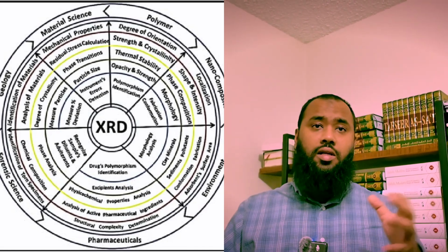So it has a far-reaching impact beyond what we can imagine. If this machine learning method is proven successful, or can be replicated by multiple labs throughout the world, I think it's going to change the XRD landscape, and it's going to solve a century-old problem in a really positive way.